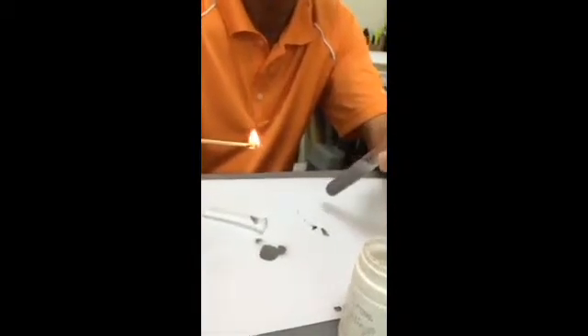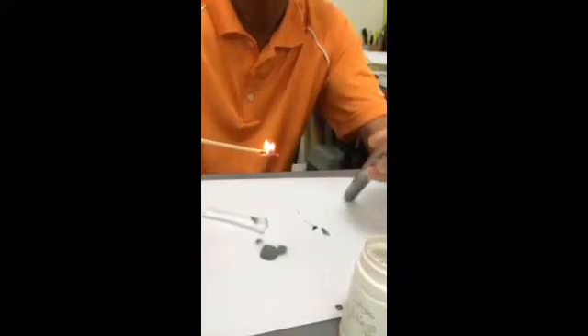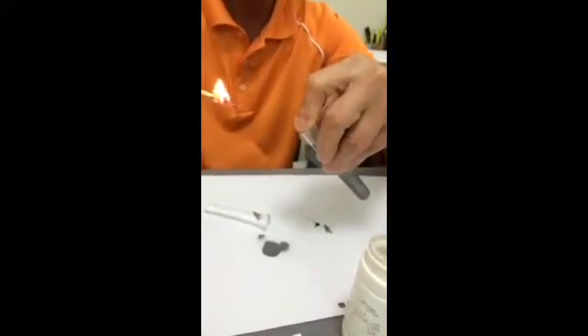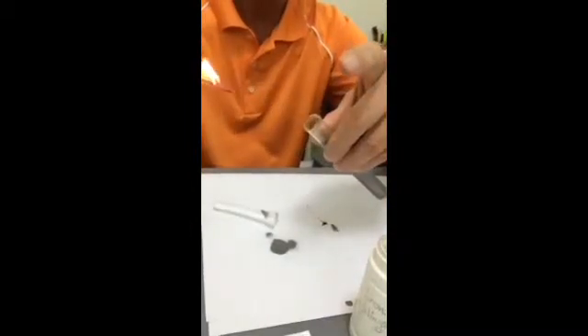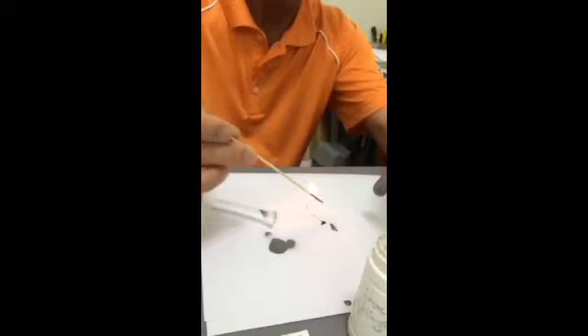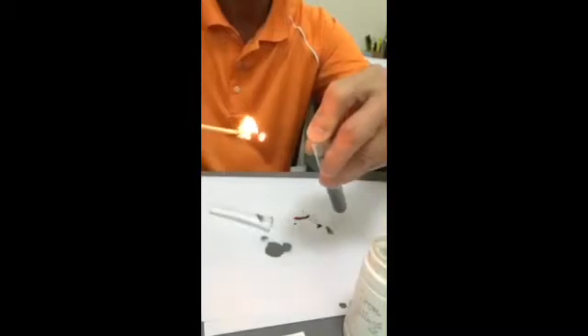This is called a pop sound and you can actually see some flame, because hydrogen is flammable. There's a flame above you, there's a mouth above you, so let me put it back there and try to collect the hydrogen.